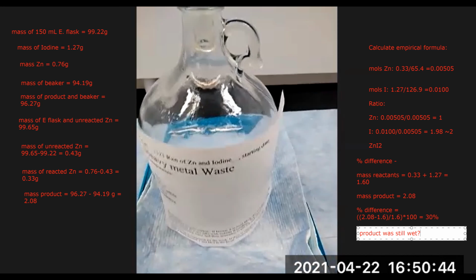Since we had a high percent difference, the most obvious culprit is that it just wasn't in the oven long enough to dry the sample. And that could be the reason for such a high percent difference, because our formula is right on, but our percent difference is quite large.